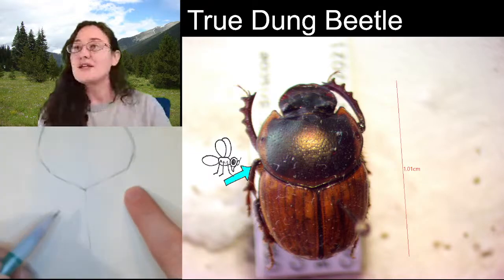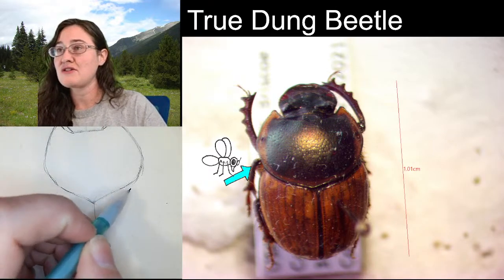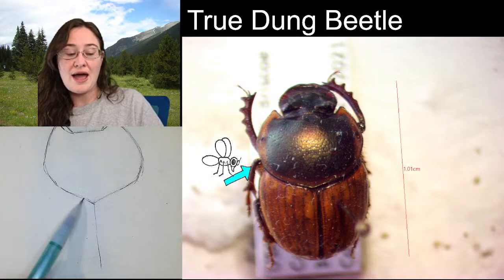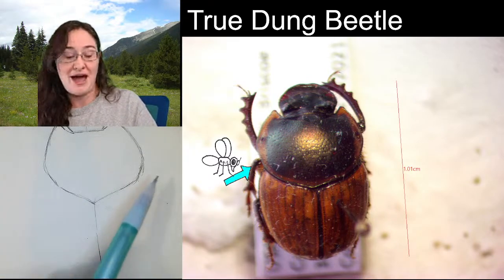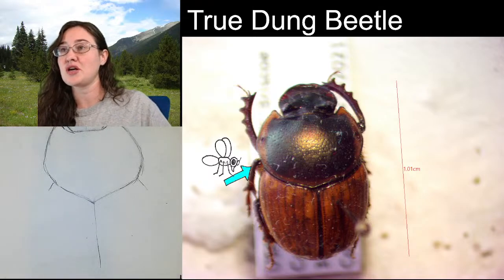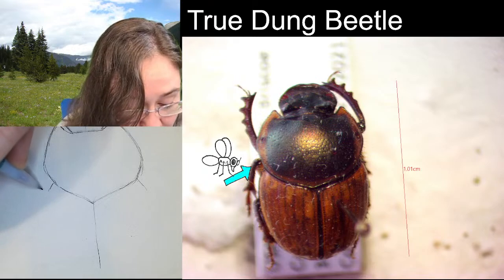So now that we are looking at giving ourselves an outline for the elytra, or these wings down here, I'm going to look at right about where this Y for my pronotum ends and starts curving back. And that is going to be where our elytra are going to come out of. Just make sure that that's even on each side.